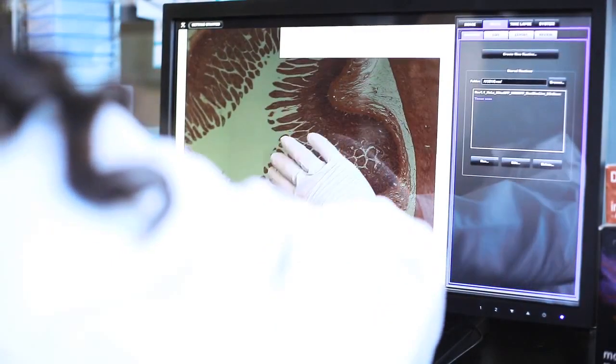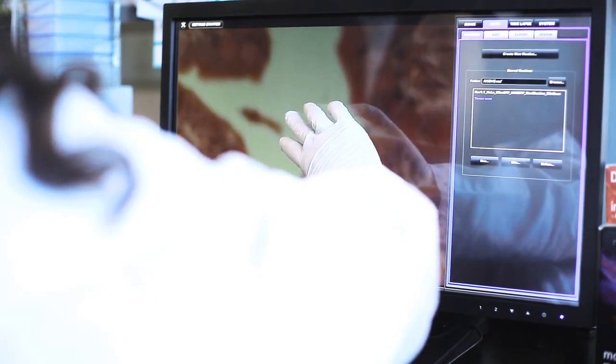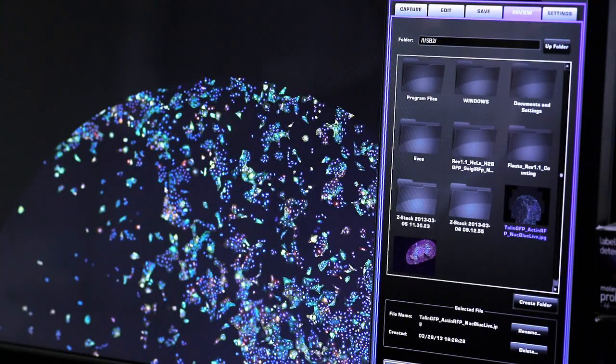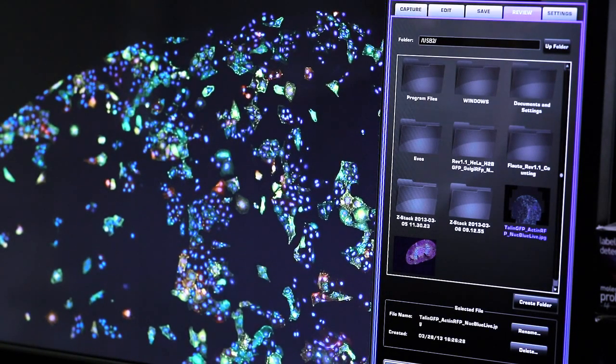Simply pinch to zoom into an area of interest without losing resolution. The image scanning and stitching capabilities are perfect for scanning tissue sections, analyzing stem cell colonies, or visualizing every cell in a 96-well dish.